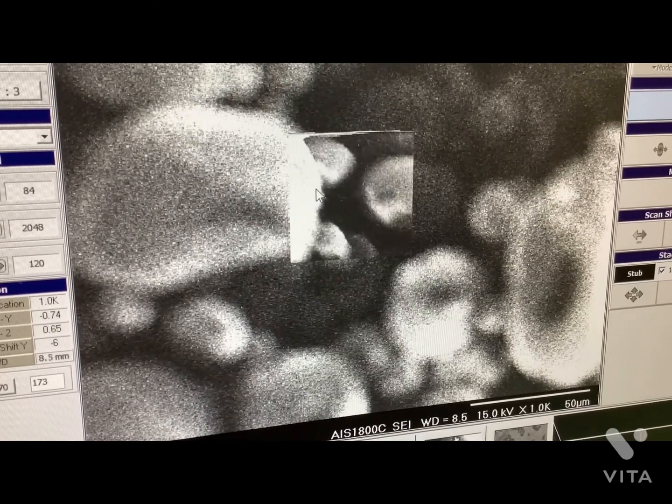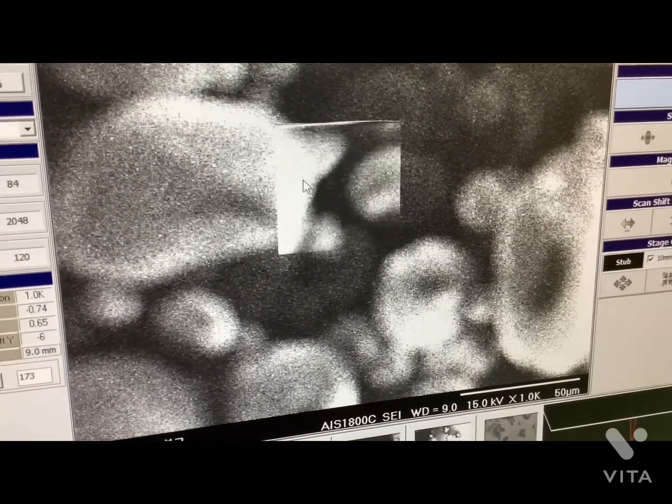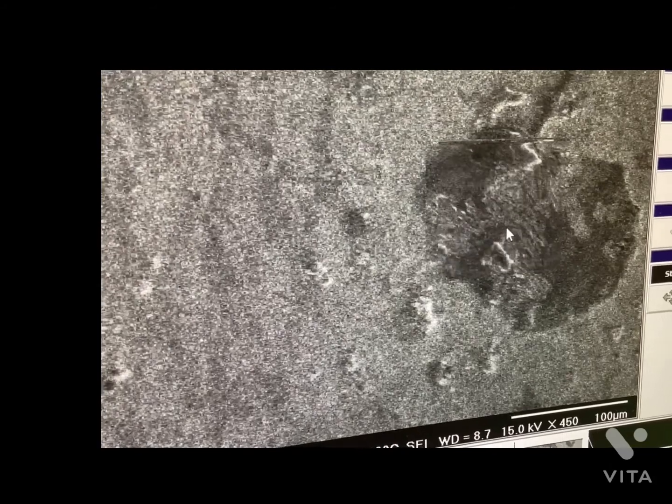A little tip on adjusting the stigmator and focus: when the stigmator is off, try to find a curved edge on your sample and adjust the focus to find a point where your image doesn't look distorted. When the focus is off, adjust the stigmator to find a point that is most clear and sharp.